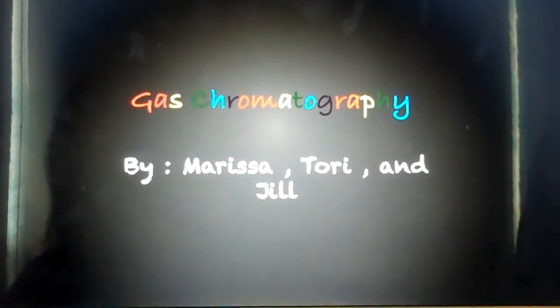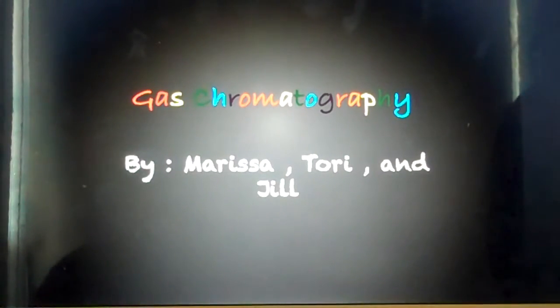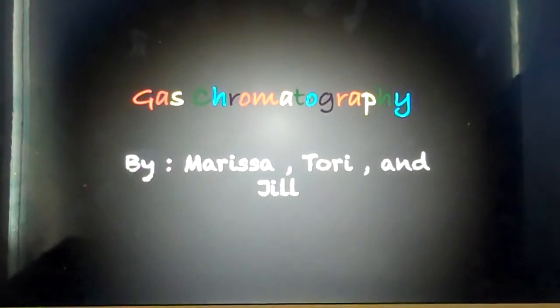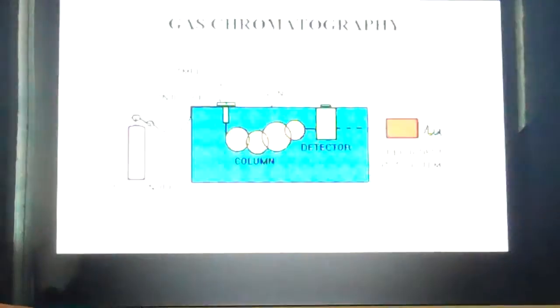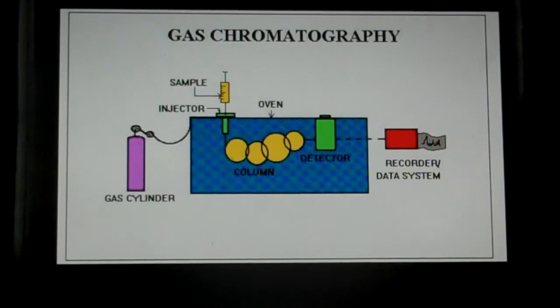Gas chromatography separates mixtures based on the distribution between the stationary liquid phase and the carrier gas phase. The carrier gas phase, also known as the moving phase, flows through a stainless steel or glass column. The stationary phase is a thin film liquid within the column. There are two types of columns, a packed column or a capillary column.